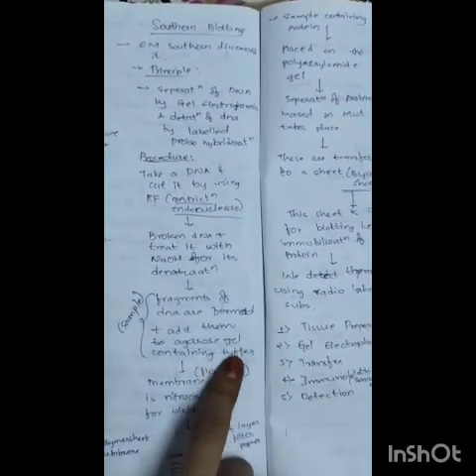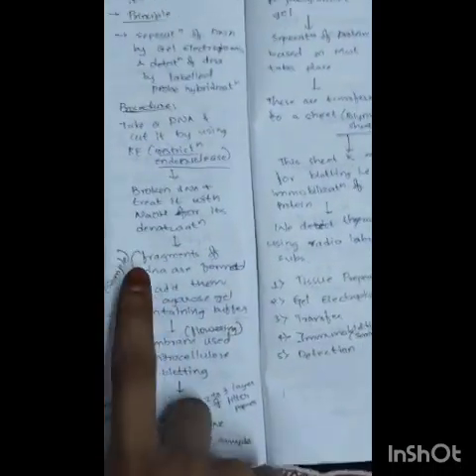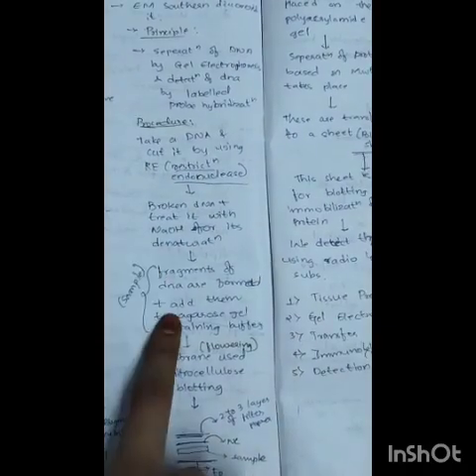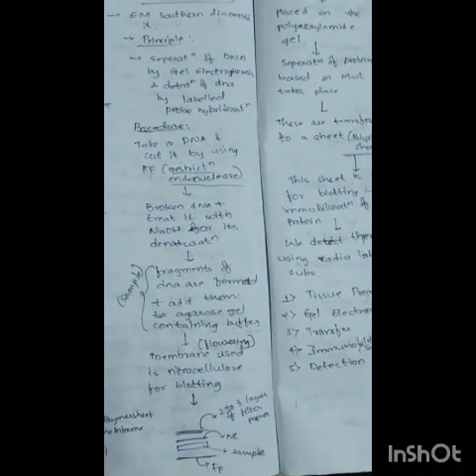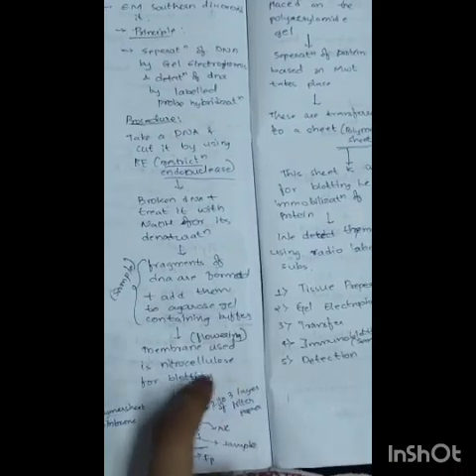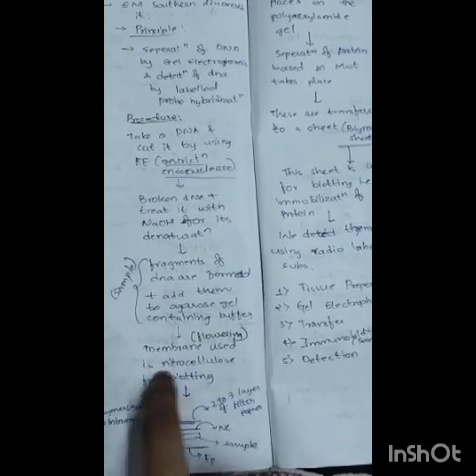Fragments of DNA are formed. To the fragments of DNA, agarose gel containing buffer is added. Now this preparation is the sample. This sample is used and then it is immobilized. For the immobilization, we use nitrocellulose for the blotting. Blotting is nothing but immobilization of the desired DNA or protein. So for the blotting, we use nitrocellulose membrane.